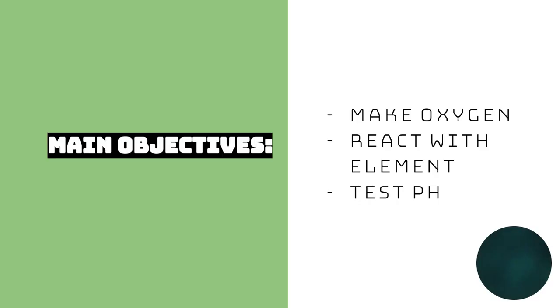So basically, an overview of what you're going to be doing: you're going to be creating your own oxygen, then exposing an elemental sample to that oxygen, and then seeing if an acid or base is produced when you add water to the products of that reaction.